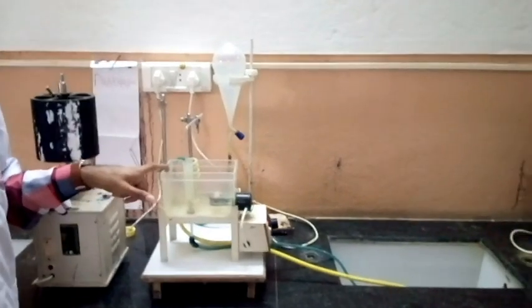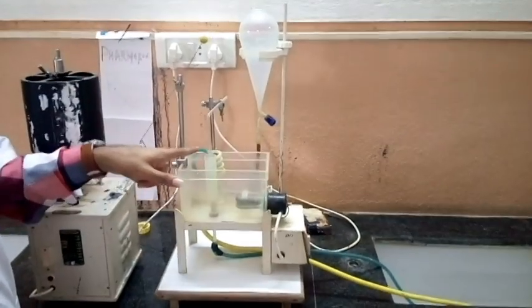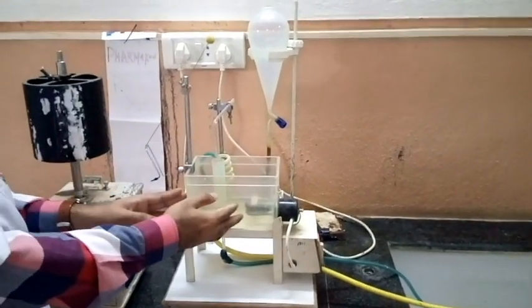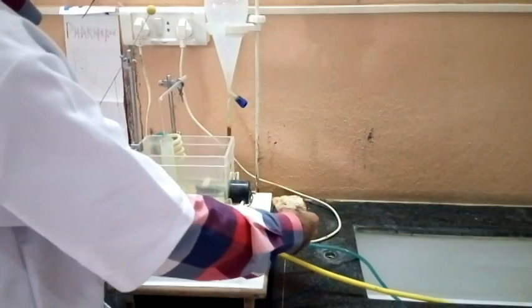The organ bath consists of two features: the inner organ bath and the outer organ bath. The inner organ bath consists of an aerating tube. The outer organ bath has the thermostat by using which we can adjust the temperature.